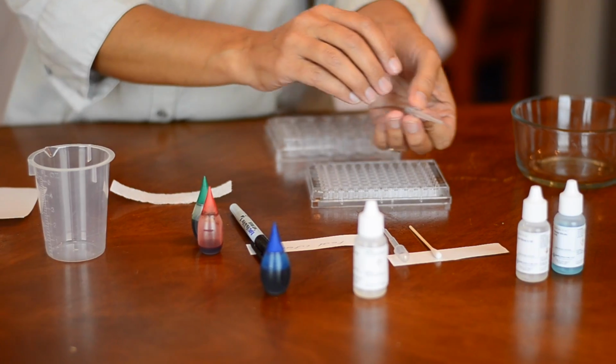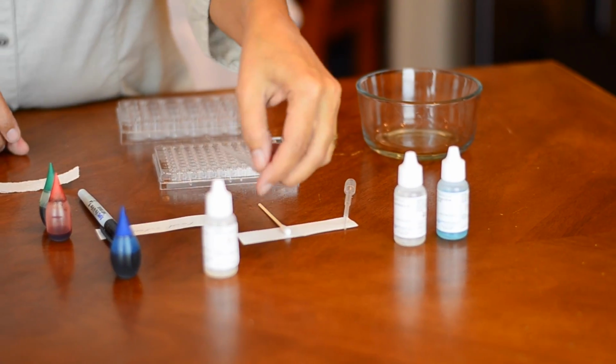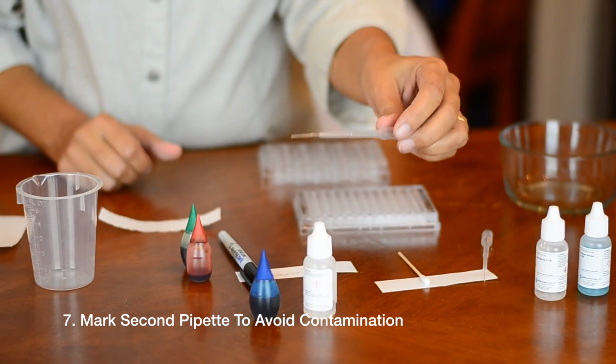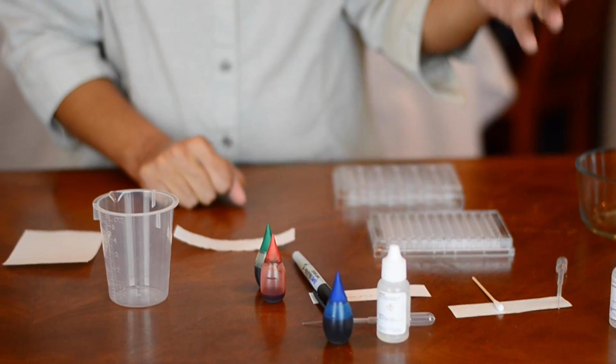I'm going to use 1 pipette to measure my solutions. I'm going to rinse well in between, and then I'm saving a second pipette to use with the potassium iodide. I've put a little mark on my second pipette. I just don't want to contaminate my reagents. It could mess up this lab, or it might cause problems for future labs if we're using the same jars of reagents again. So even though this is a basic experiment and you're doing it in your home, good technique is important, and you can develop those technique skills even in this setting. So it's good to pay attention to those details.